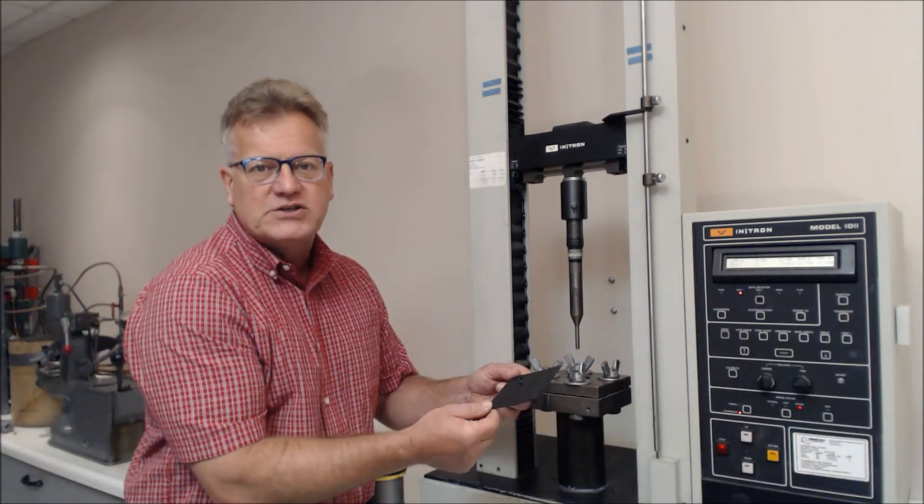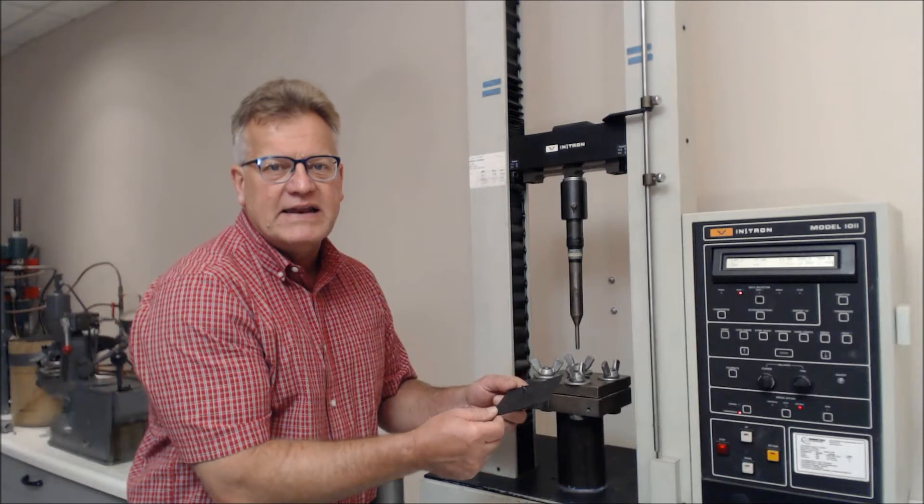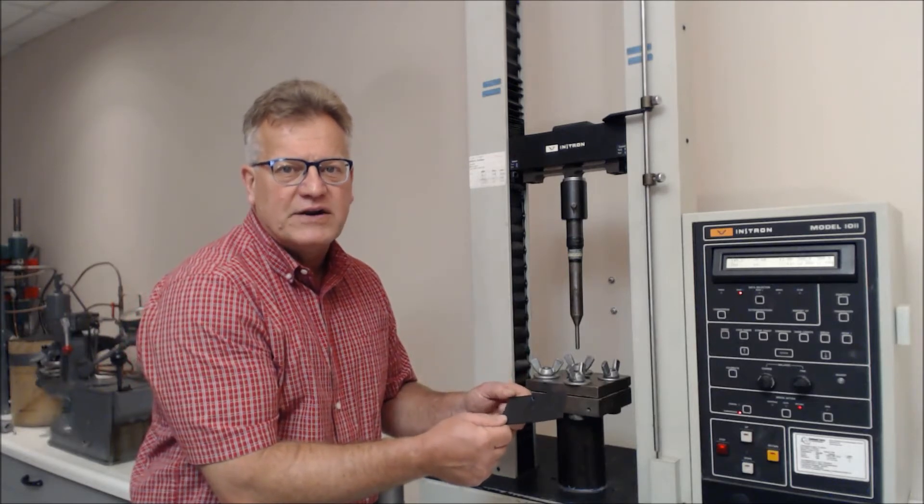So this is pin puncture, or some people call it index puncture, ASTM 4833.